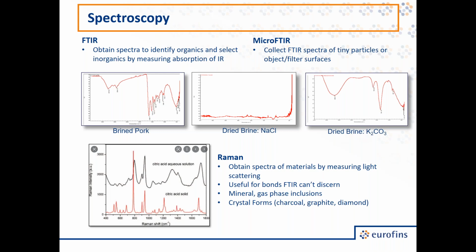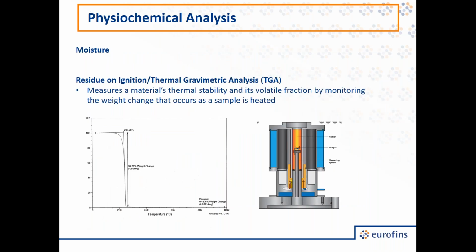We'll have a portable Raman spectrometer. An officer or somebody out in the field, even in the factory, can simply put one of these devices next to a plastic bag containing whatever the unknown material is and get a spectrum of that material through the bag without even opening it. Very powerful for quality control, but also very useful in the laboratory for giving us another way to get information about how molecules are put together. There are many other types of spectroscopy that we use in foreign material identification, but those are subject for another lecture. The next slide, please.